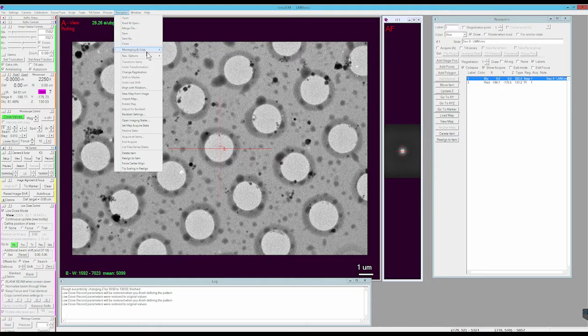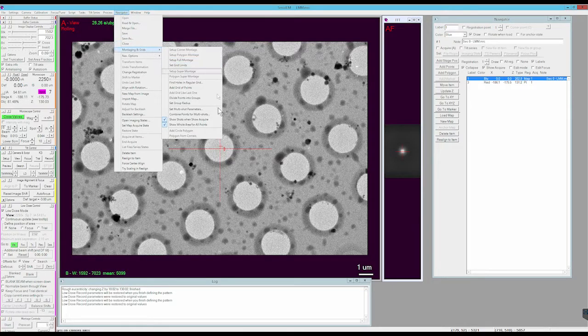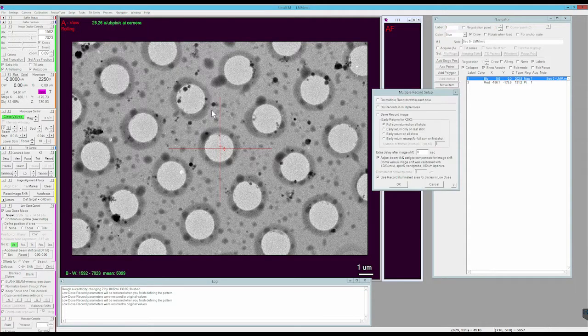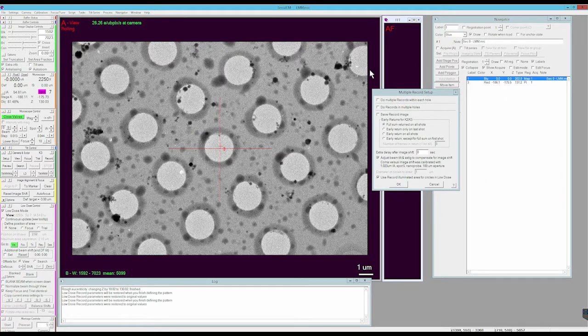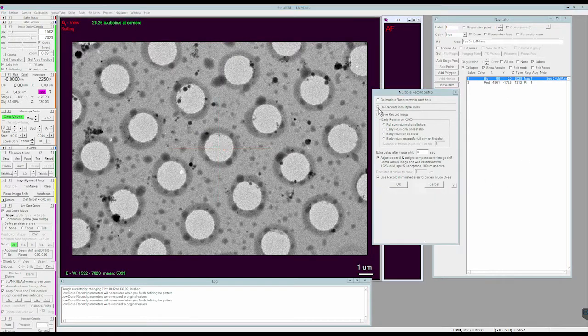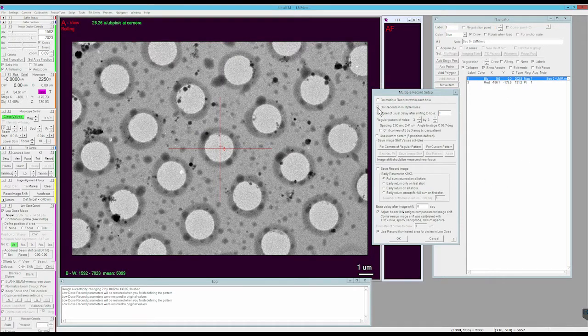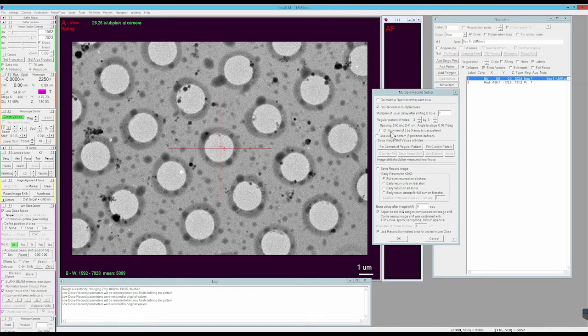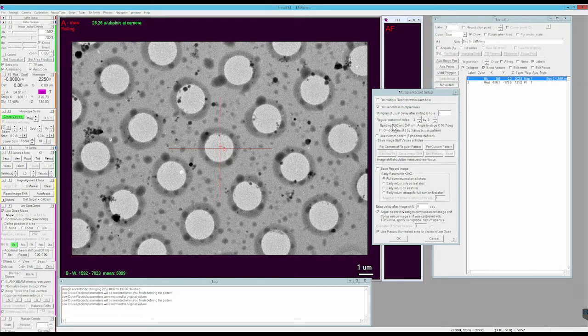In Navigator, Montaging and Grids, select Set Multishot Parameters. The option I want to start with is Do Records in Multiple Holes. Select that and we need to create a 3x3 pattern.